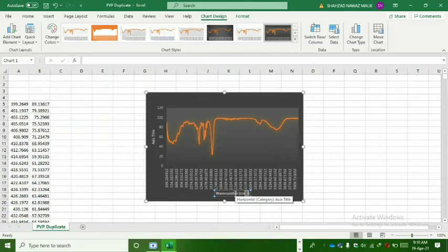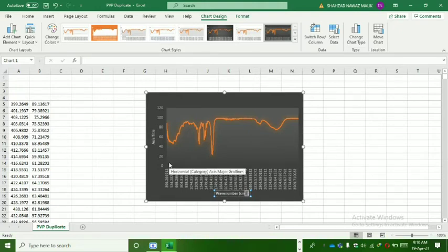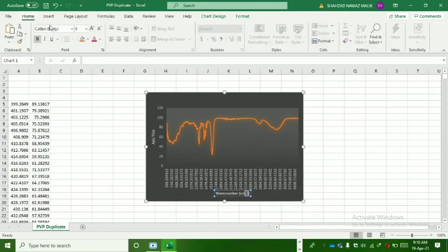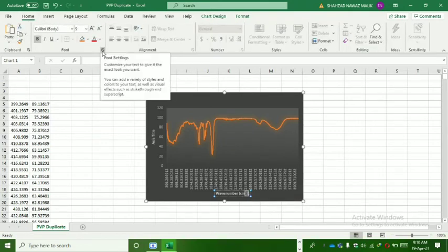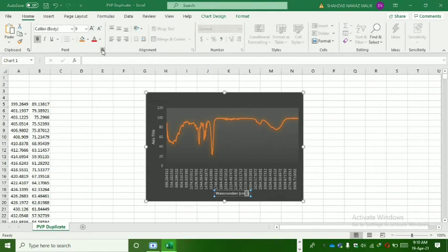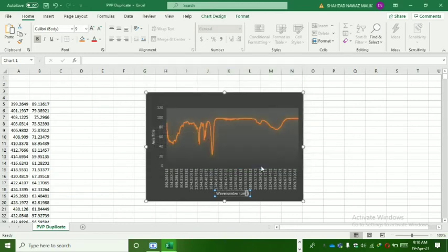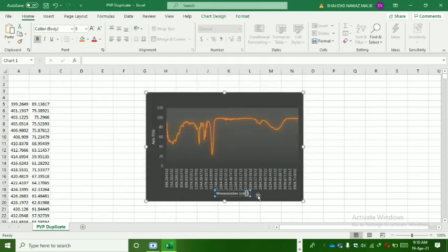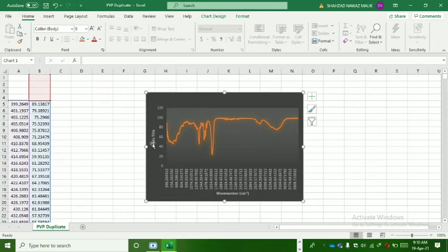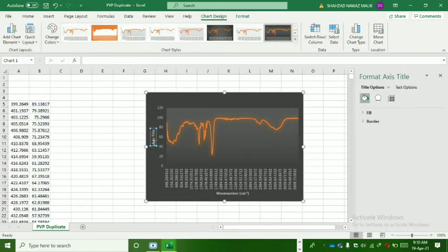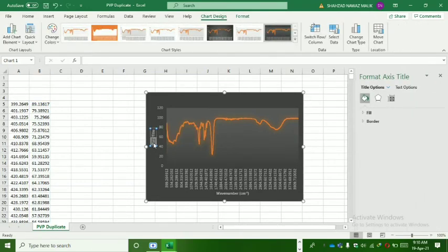To write the number in superscript or subscript, we select it and click on Home. Here we see font settings. We click on it and right-click on superscript option, and then OK. It will move to exponential form. Now for y-axis, as it is transmittance, we can write it easily.